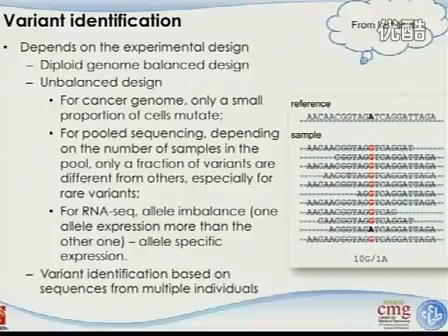And variant identification based on sequences from multiple individuals, that's another topic we talk about. And for most applications, we don't really need that unless it goes to low coverage sequencing, like the 1,000 Genomes sequencing, which is only 4x coverage.